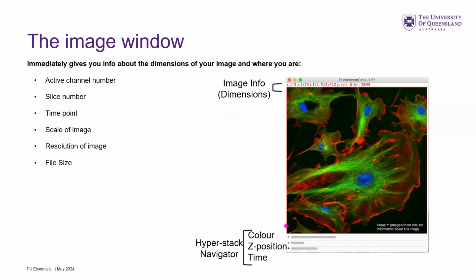Down the bottom of the window, you have these sliders for whatever kind of dimension you have. Whether you've got channels, Z slices, time points, positions, whatever's loaded in, it can deal with them and you can quickly scroll through time.